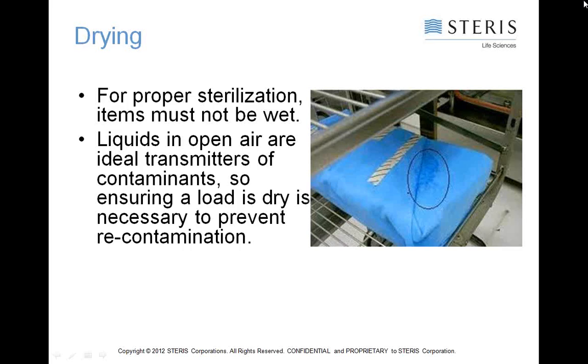Fermenter comes to mind, or tall vessels. That pre-vacuum cycle is going to be required to remove the air from inside. Otherwise, it's going to sit at the bottom of the container, not able to fall through the solid bottom of the container and out the drain. So we use a pre-vacuum cycle to ensure air removal in those sort of challenging loads.